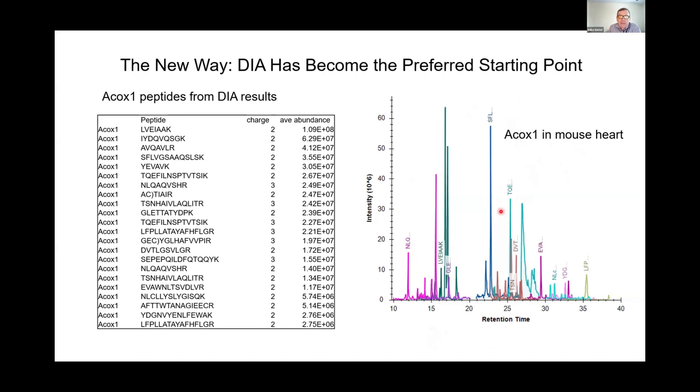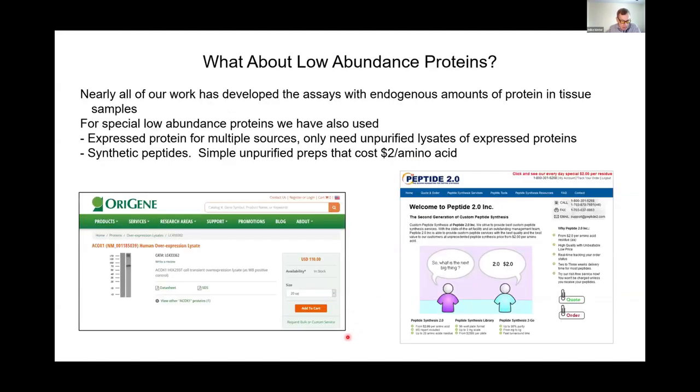And so it takes away our need to calibrate all the best flyers: the best flyers from ACOX-1 respond about the same as the best flyers from horse serum albumin. That's our internal standard, and so this gives us an approach to do absolute quantitation. But this is a great starting point, and something that we maintain through this data library.